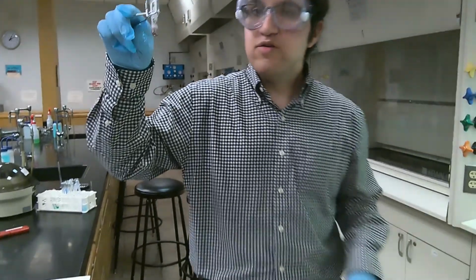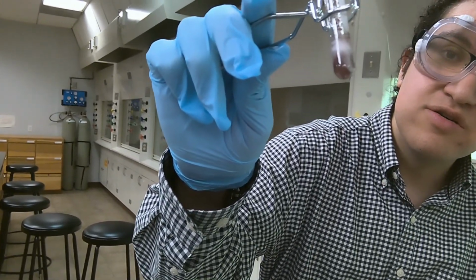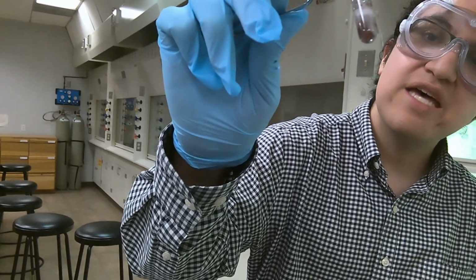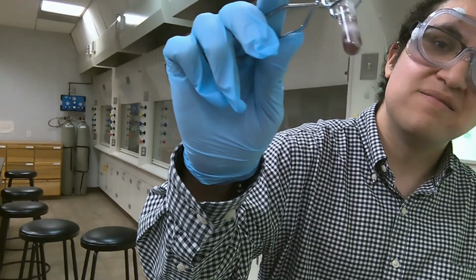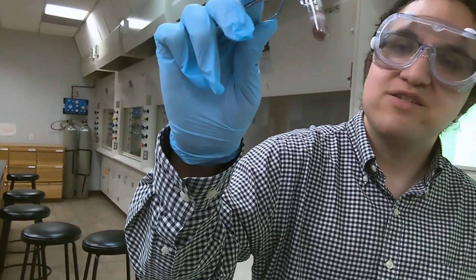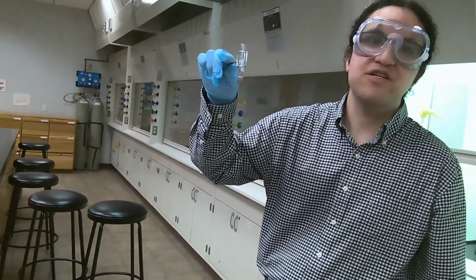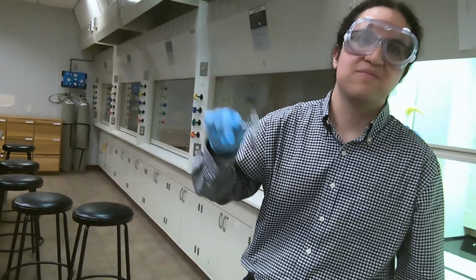And now I want you to observe in this reaction mixture, if you notice any additional color changes for our solid, what is coating the surface of our magnesium ribbon, and what would we identify this new solid generated as? And as you see, I'd also like you to think, why are we generating so much gas in this process? Okay, so we'll let this reaction continue on, and then we'll resume when we talk about the washing steps.